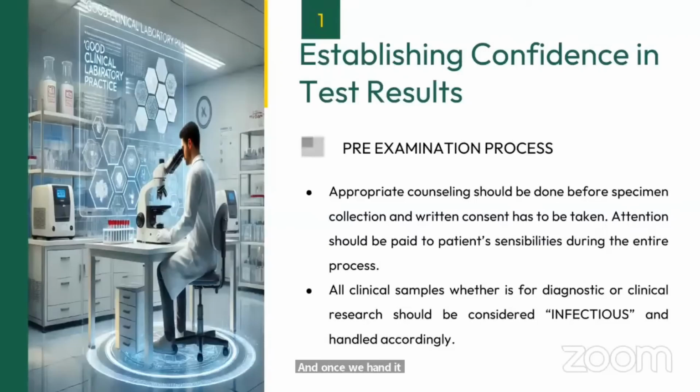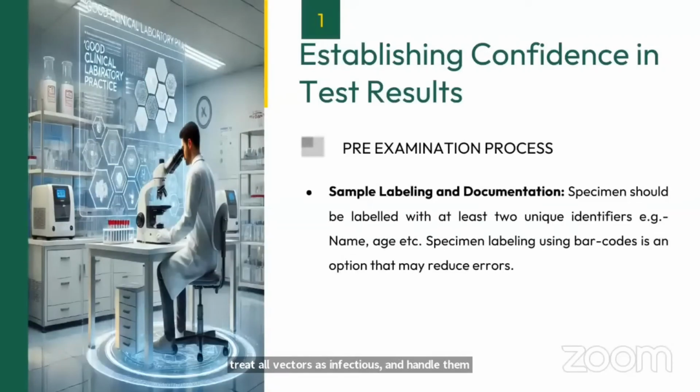So, all samples are infectious. There is no classification of which is infectious and which is non-infectious. Certain samples may be detected as positive, so you know that they are infectious. Certain samples may not be detected, but there is a chance that they can be infectious. So treat all samples as infectious and handle them accordingly as per the universal safety precautions.